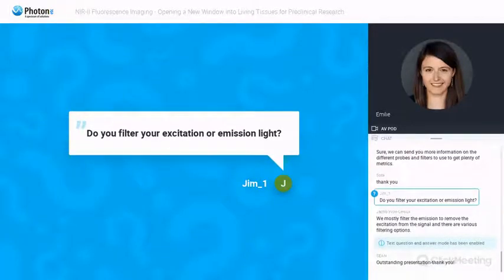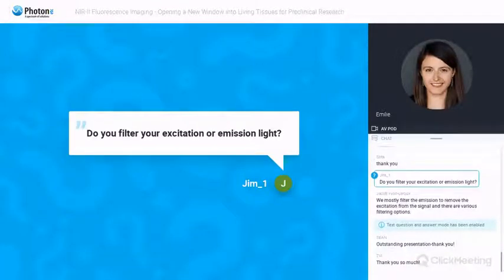Okay, so we'll start with a few questions. A question from Jim: do you filter your excitation or emission light? So the excitation is not filtered. We use lasers at specific wavelengths, but we do filter the emission light.